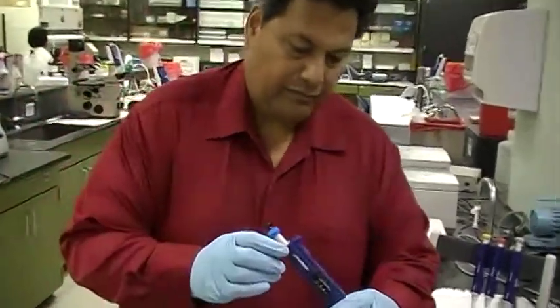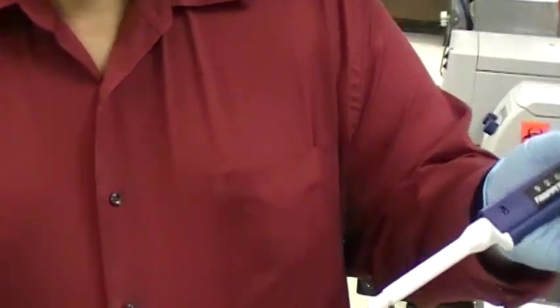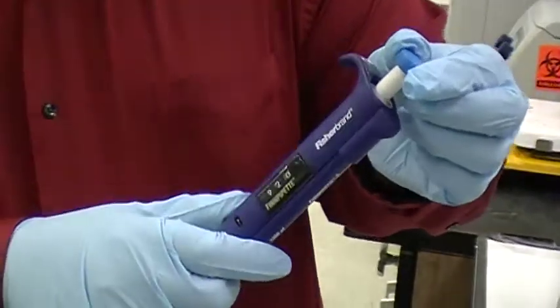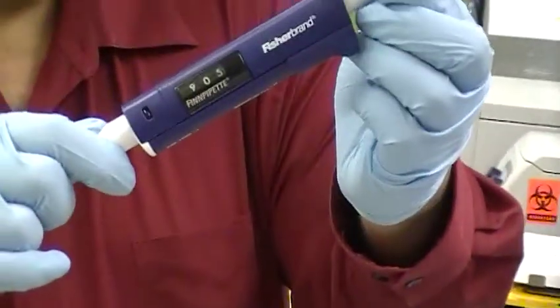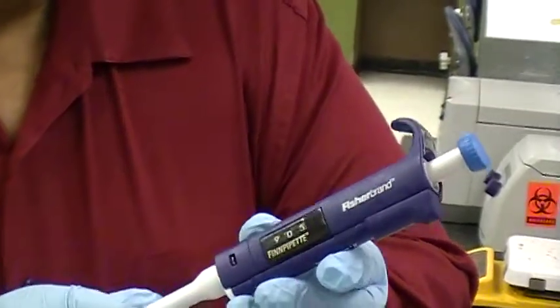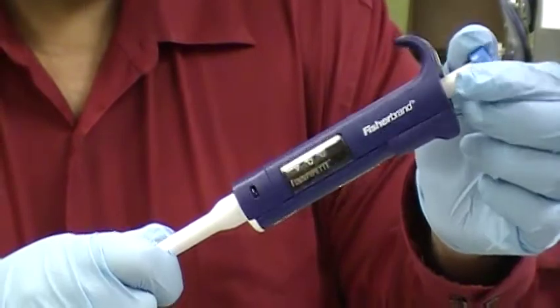If you look at it from the side, you will see a knob on the top, and this is the knob that turns to change the volume. And then you will see a window that has all the numbers, and you can adjust it. It's in microliter volumes.